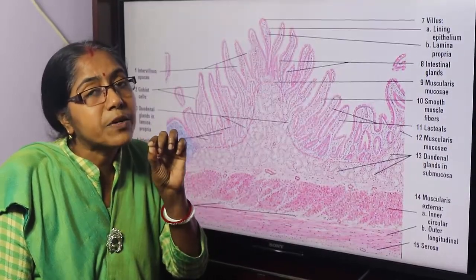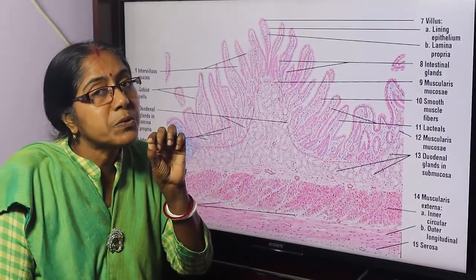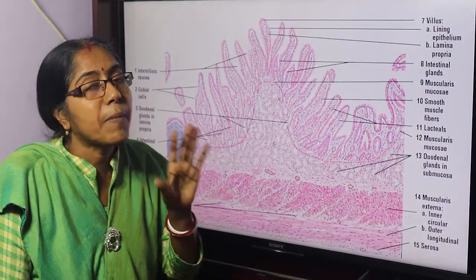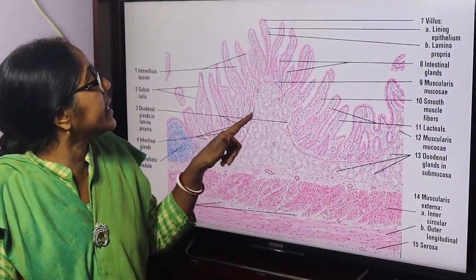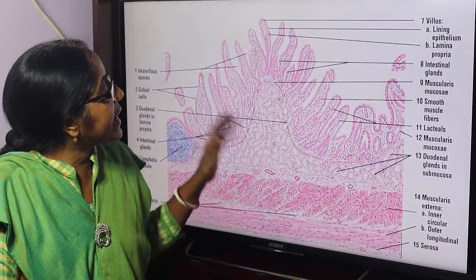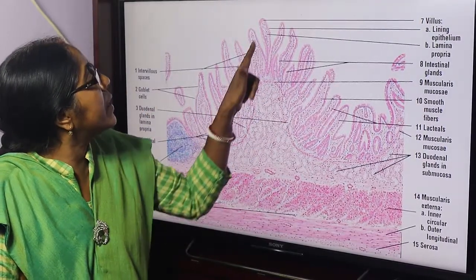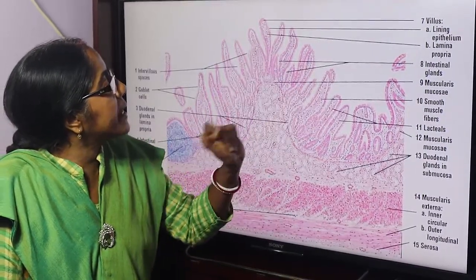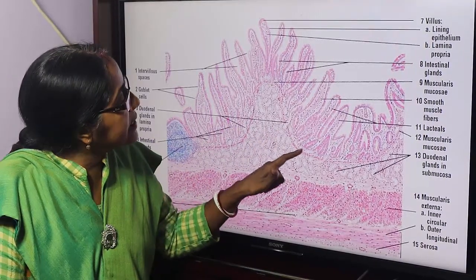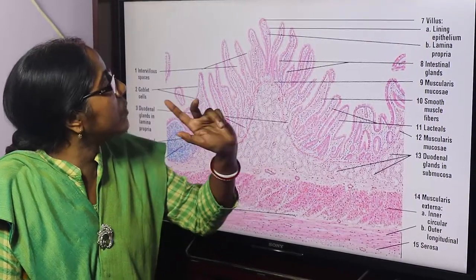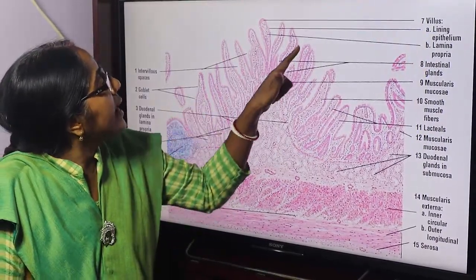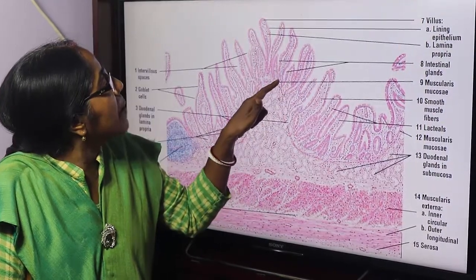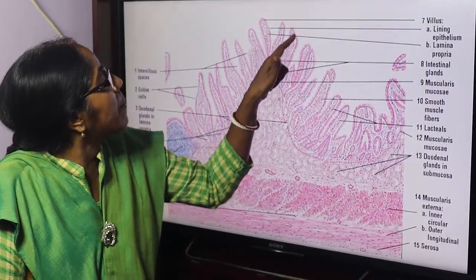Microvilli is the protrusion of cytoplasm into the cell membrane. Looking at the slide, this is the mucosa — lining epithelium, lamina propria, and muscularis mucosa. The lining epithelium and lamina propria form the villi structure.